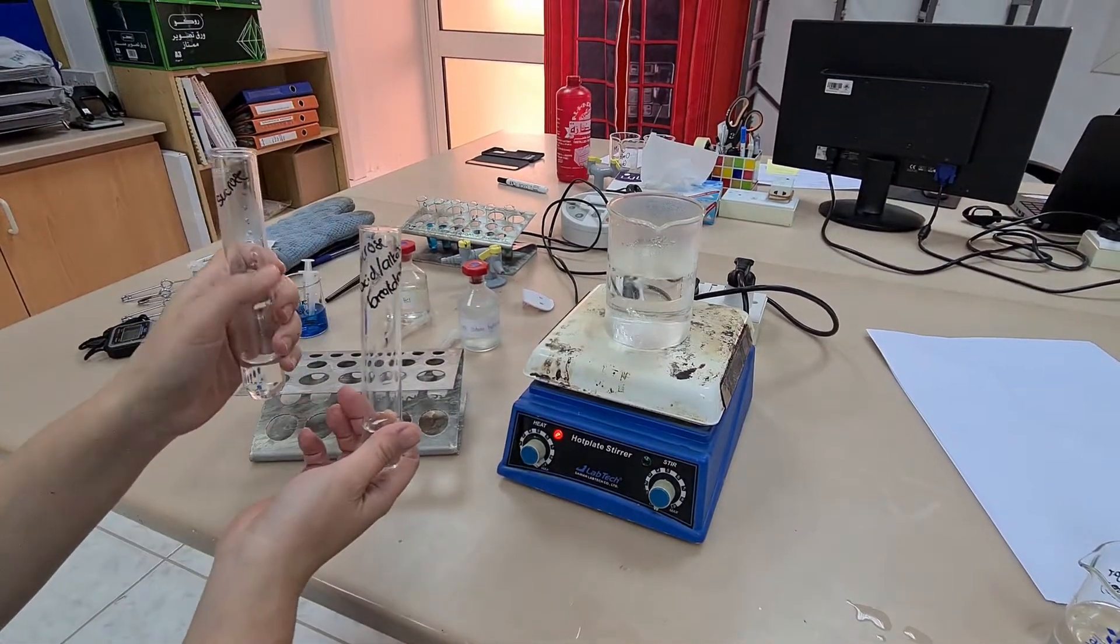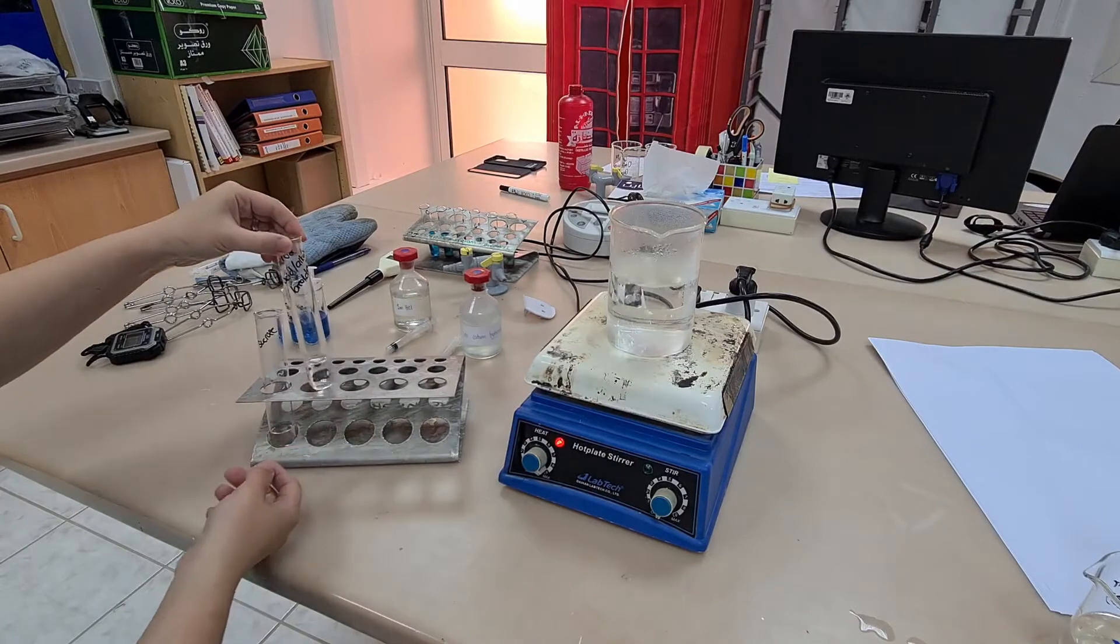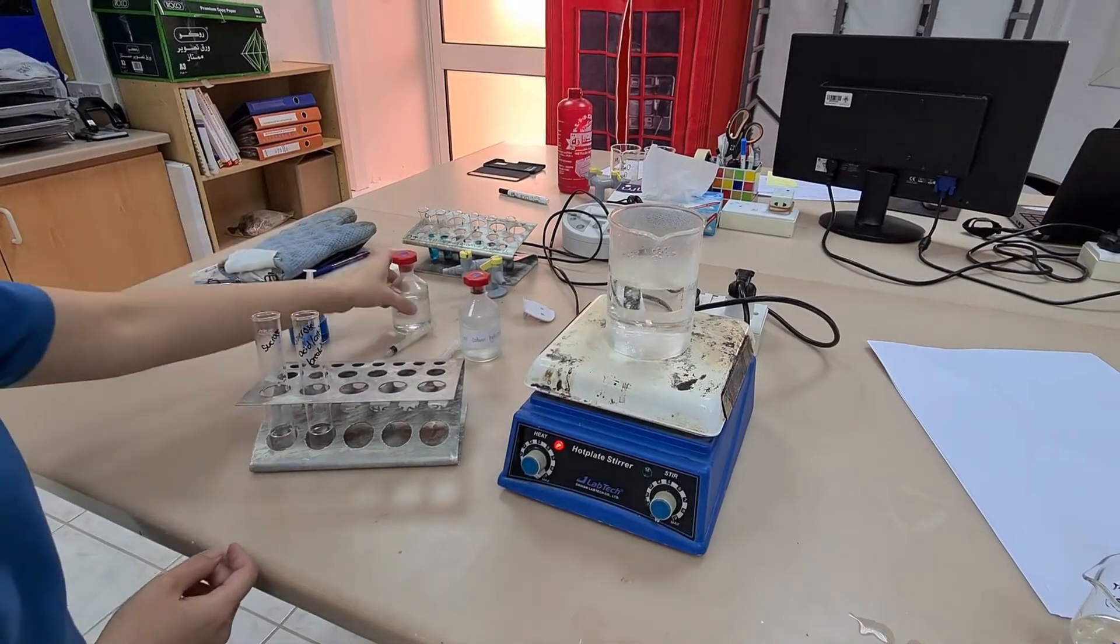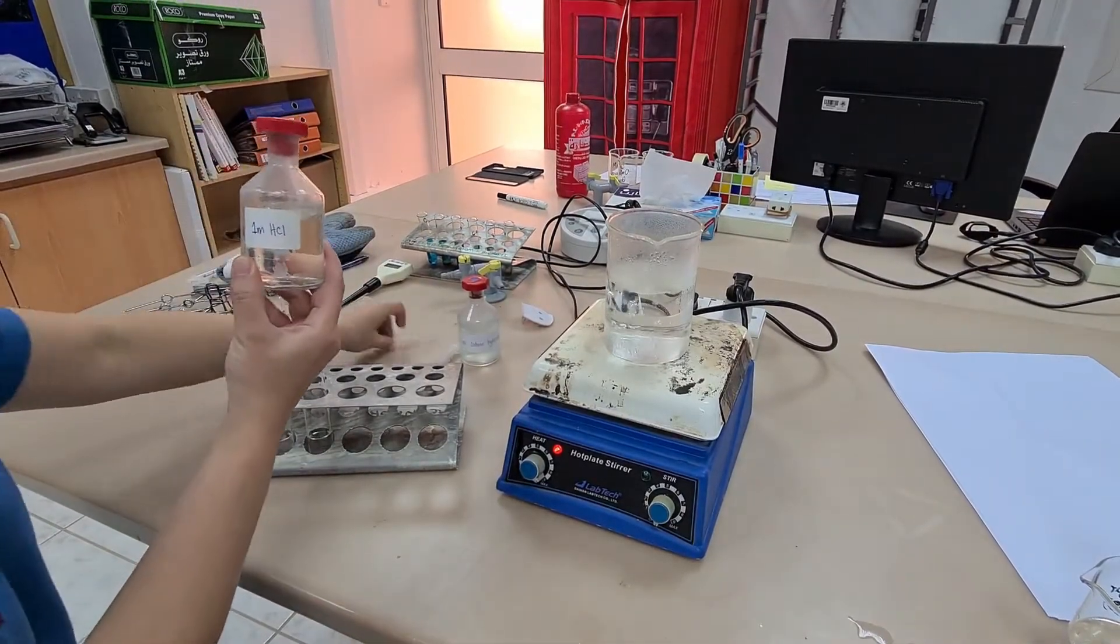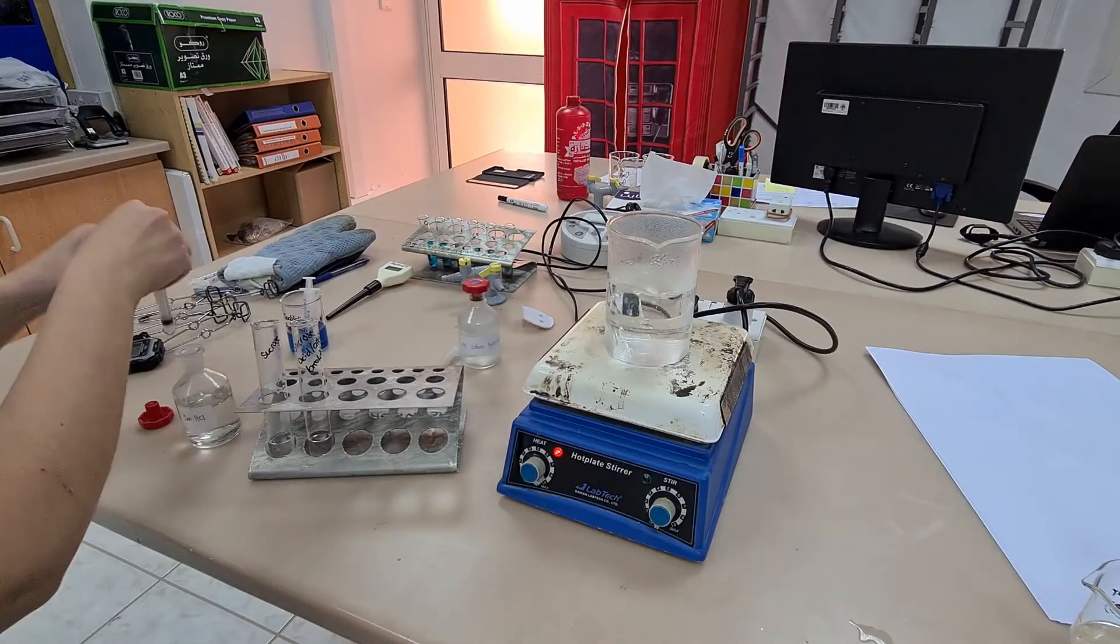We are doing a chemical test for disaccharides. I have sucrose solution in both test tubes. If I tested these both now I would get a negative result, but in one test tube I'm going to add some one molar hydrochloric acid.